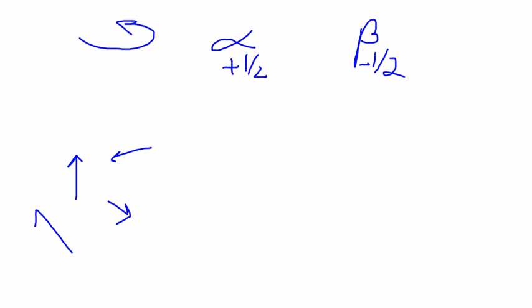And so now when you generate a magnetic moment, in the presence of an external field, it's going to generate two spin states. One is called an alpha state, the other is called a beta state. So you can have what we like to say a plus half or a minus half energy state associated with it. So one can say that when we don't apply the magnetic field, we have the spins moving in all different directions. So that's like random behavior.